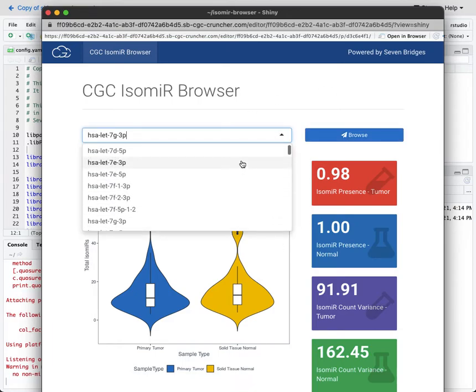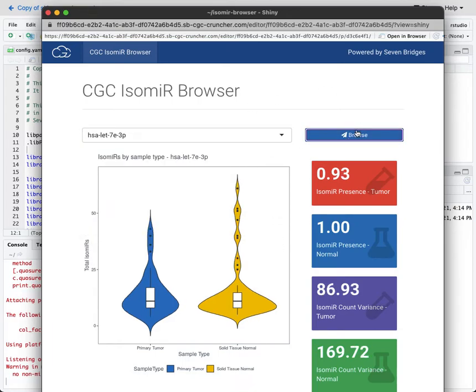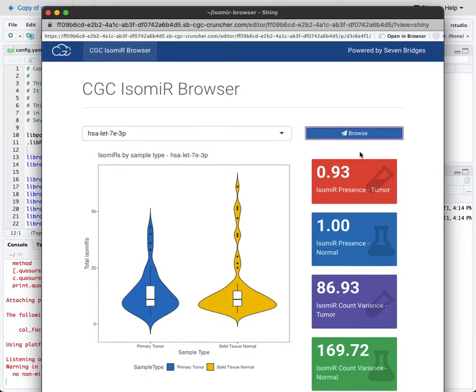And this would allow someone who doesn't need to write a single line of code or interact with those tables or create their own harmonization scripts to bring them together to actually come and analyze the data, which really nicely shows the full range of secondary processing, also downloadability, and also tertiary processing that you can do with the data on the platform and keep it all together in this collaborative workspace.